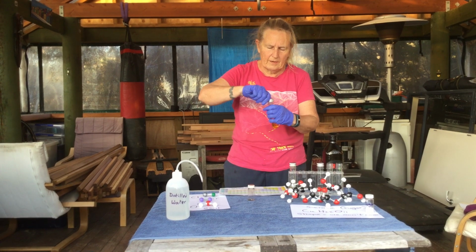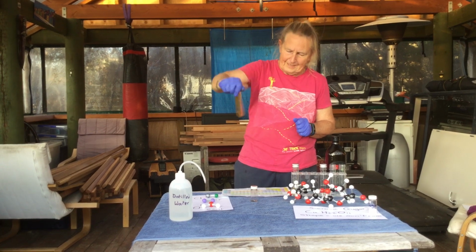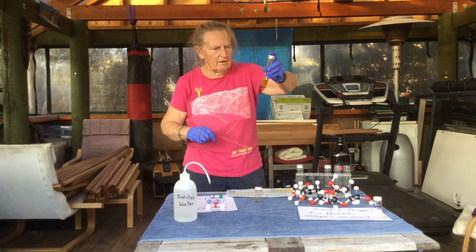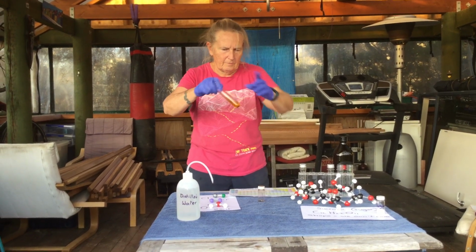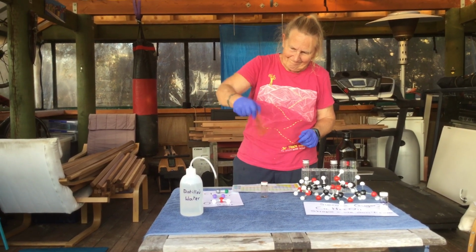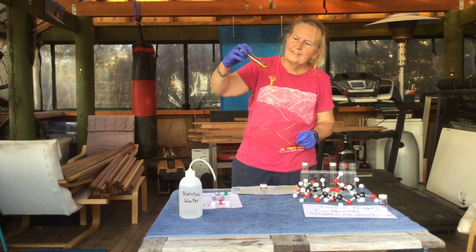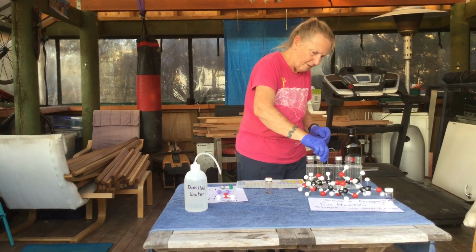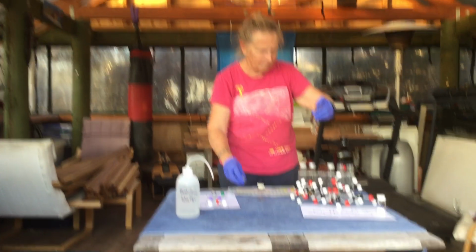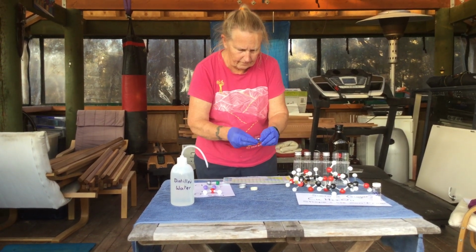So when we're talking about this, remember we're talking about the sharing of electrons. So I'll give this a really good shake. This oil is actually quite dark, and so it might be difficult to see. Okay, it doesn't look as though it's going to dissolve in that either. I've got some paler oil though, which might be easier to see. So this is some cheaper oil, not the olive oil. I'll give it a go.